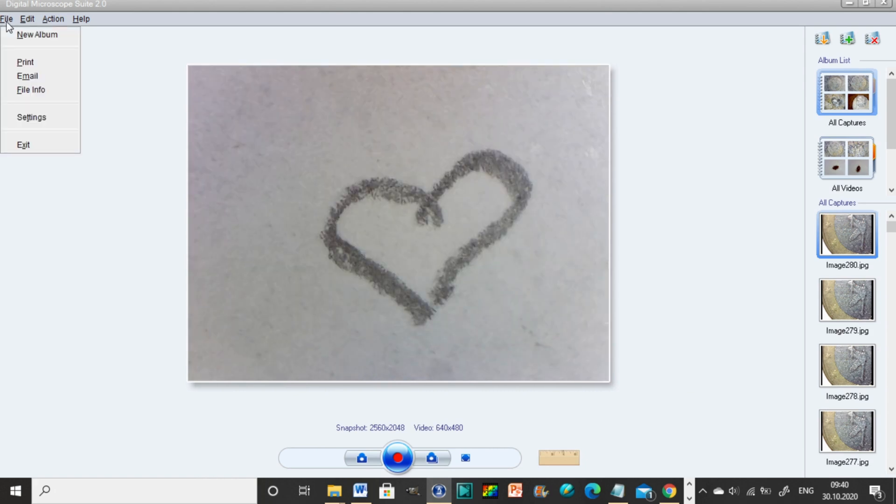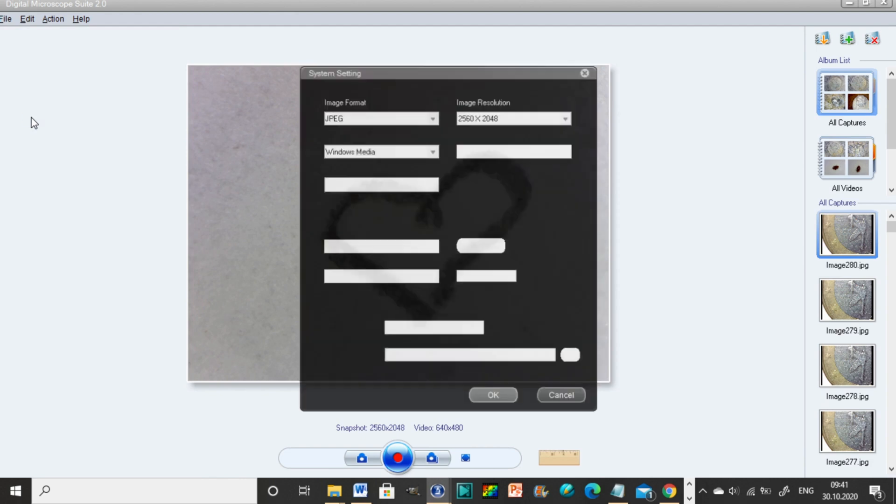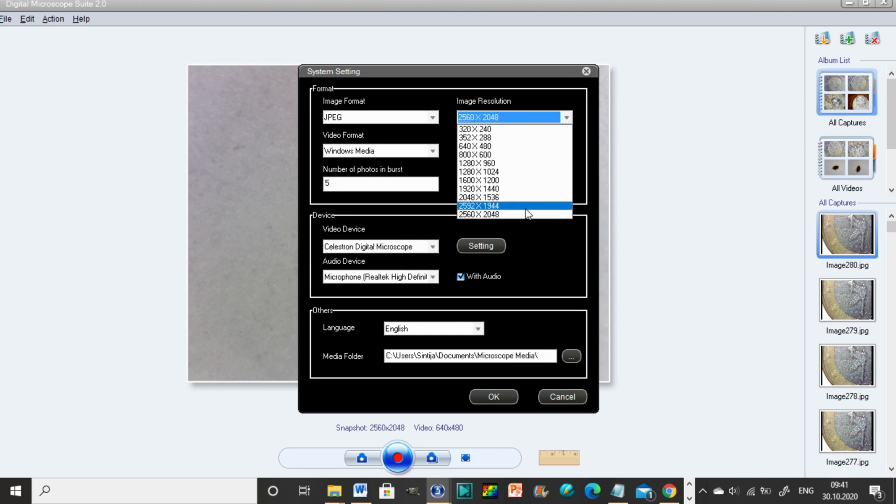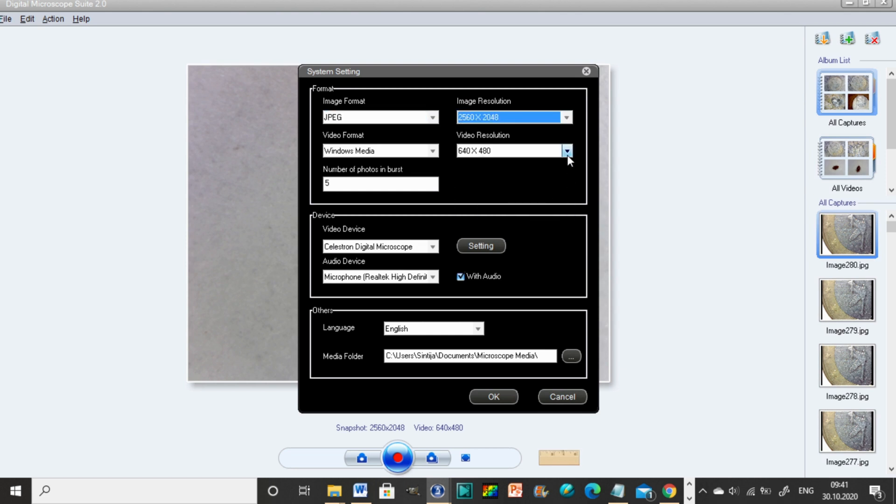You can change the resolution by going to File, then Settings. But I was already taking photos and filming in the highest resolution, so you can't get better quality footage than I already showed you. You can also record with or without sound.